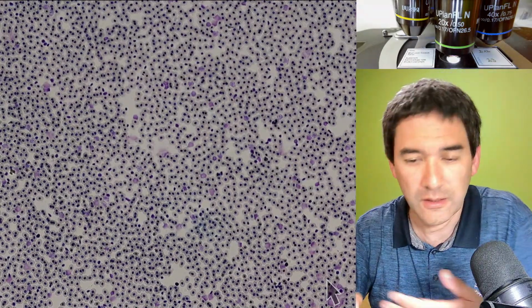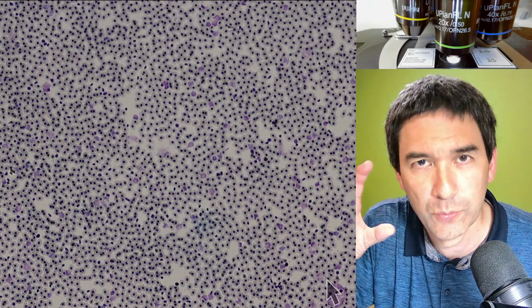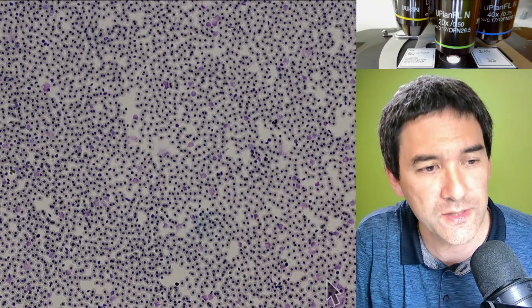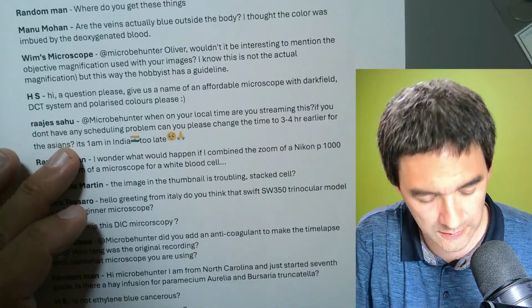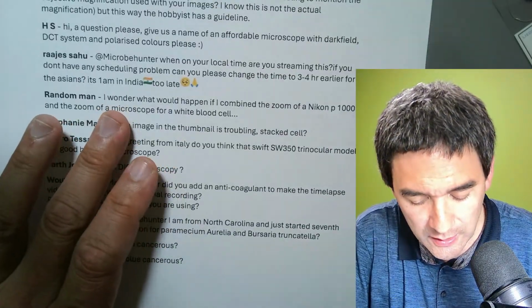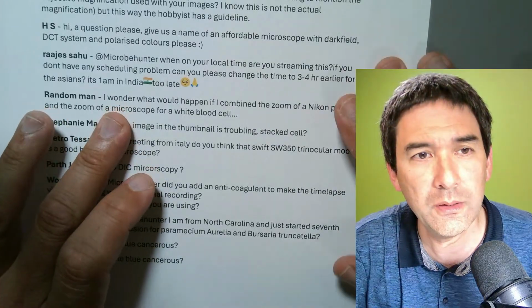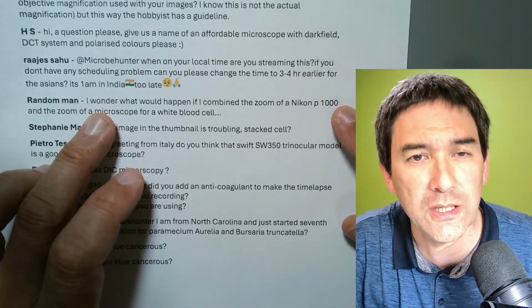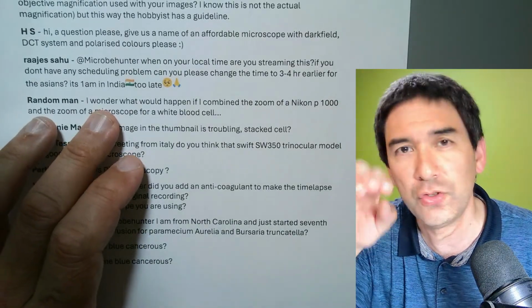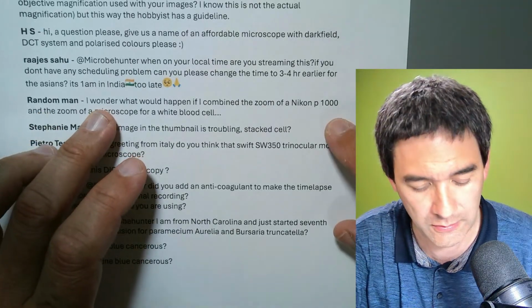So that's what I would like to emphasize: you have to move away a little bit from magnifying over the camera and towards magnifying with the objectives. But I encourage you to try it out, because some people have contacted me and said, it's correct that you might not gain additional image detail when you zoom in, but it might still be more convenient to look at the object because it's simply bigger. So you just get it bigger and blurrier, but it's fine. Yeah, I get it.